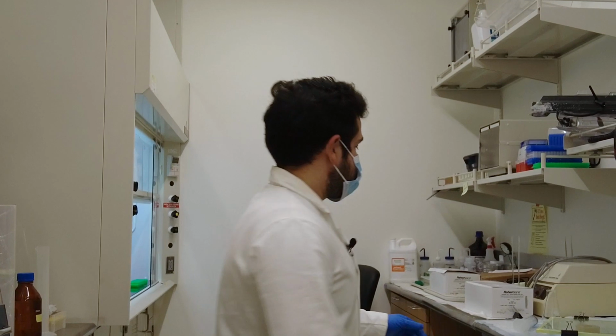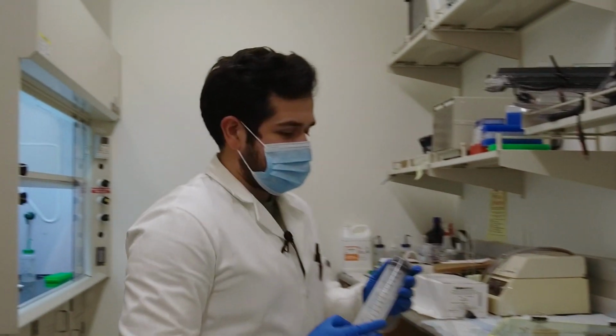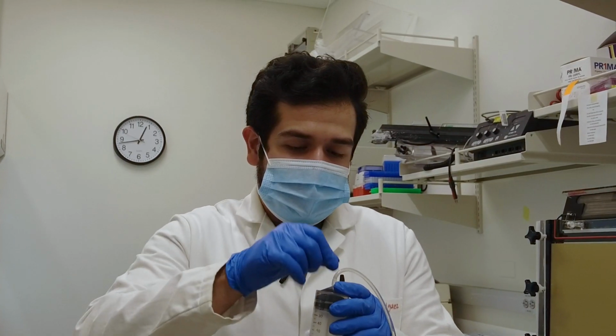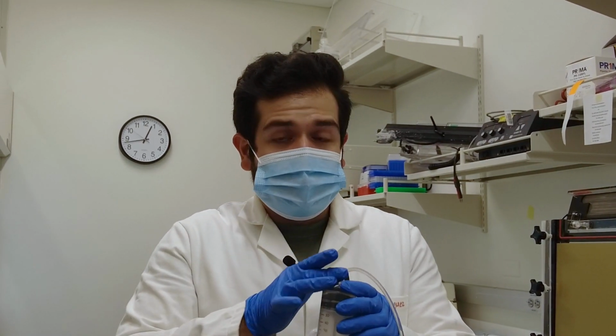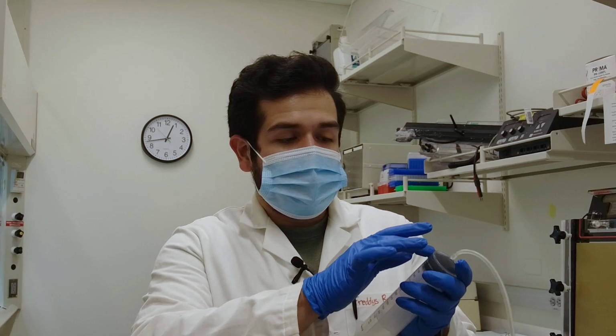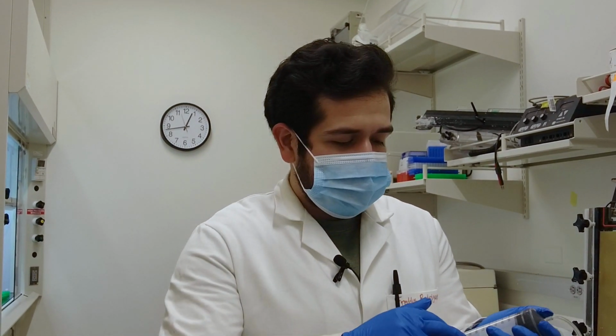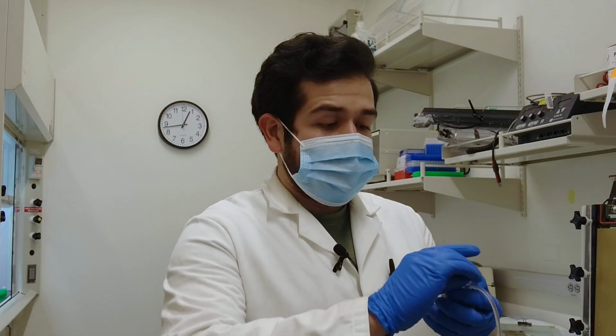The best way to do so, with this syringe, is to take off the tubing, then get a pipette tip and stab at the opening once you've removed the tube in order to draw in some air to take off that little piece of gel that will form in the syringe. Then you can fill the syringe with water and do your best to push out this piece of gel that's forming inside the tubing.